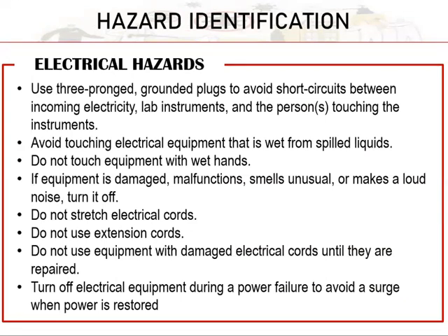Okay, next is electrical hazard. Ma'am, why is it important to include electrical hazard? It's because, class, when you enter the laboratory, most of the things you will see inside are machines. Of course, these machines will not work without a source of electricity. So we need to remember the following precautionary measures in case of emergency, on how to minimize electrical hazards. Number one, use three-pronged or grounded plugs to avoid short circuit.